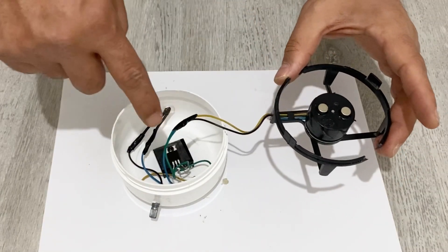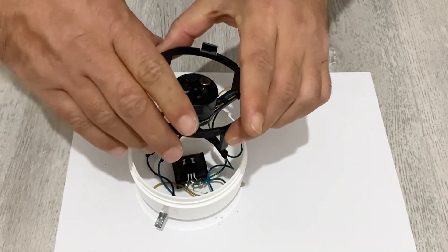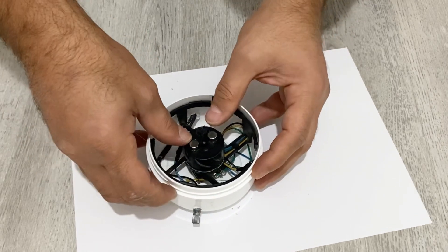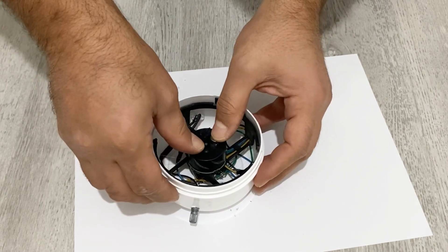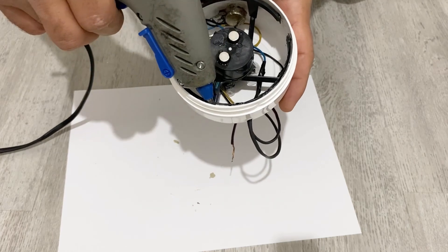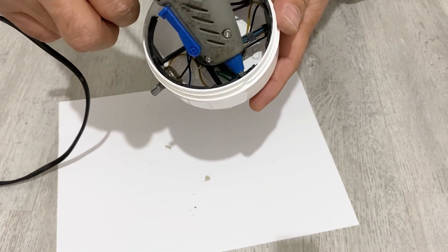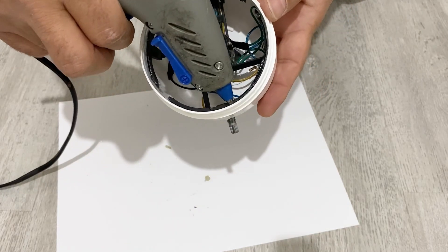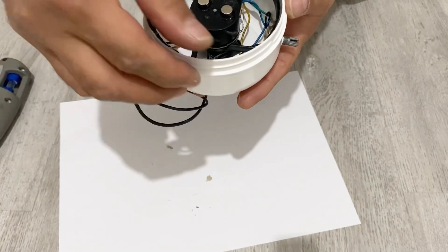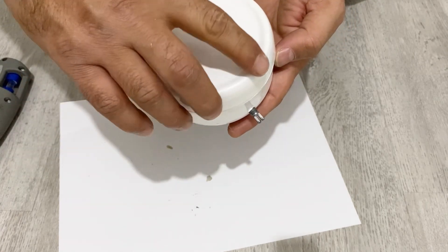Now it's time to put my DC motor into the box. Again, I'm going to use a little bit of hot glue — not too much — and just fit it inside. Before closing the lid, I will stick everything together very well using hot glue. Now I'll wait until it's dry, and then close the lid of the box.